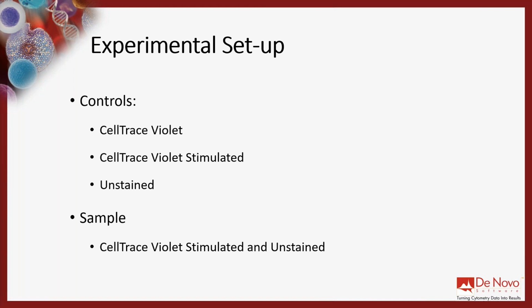Now, just kind of a little thing to throw out there is to remember that when you run this on your cytometer, you should save your instrument settings, save your layout or your worksheet or your document that has all of your plots and your gating on there. So as you look at this over multiple days, or if you look at this at multiple time points, you have the same settings, so you're starting from the same point, so things aren't moving all over the place.